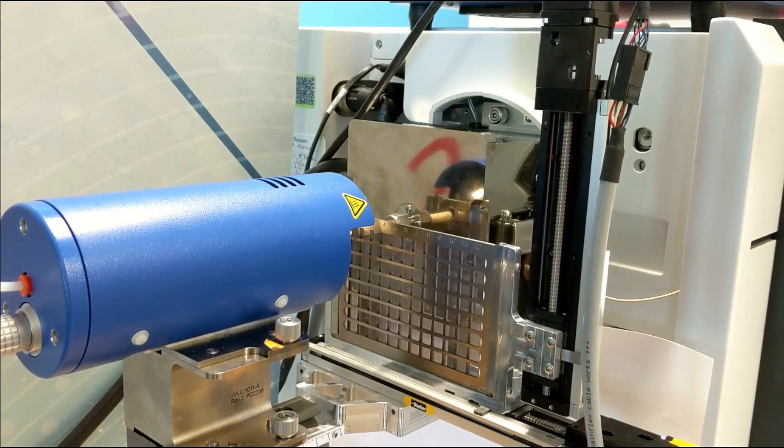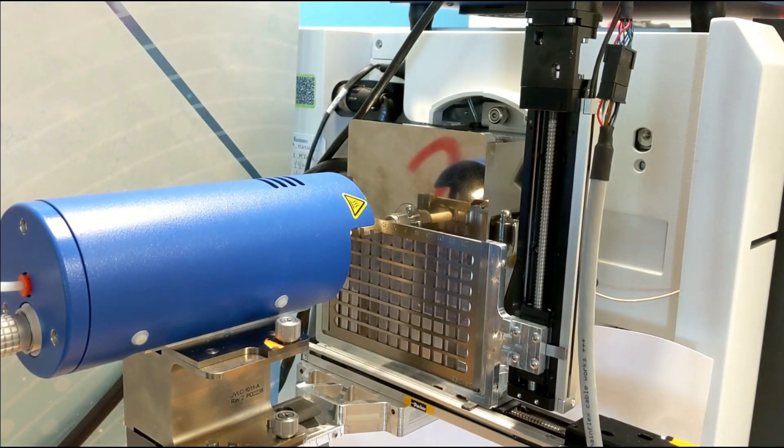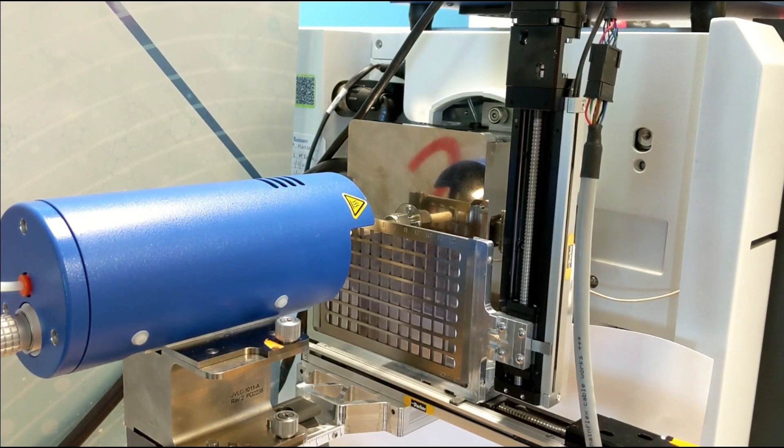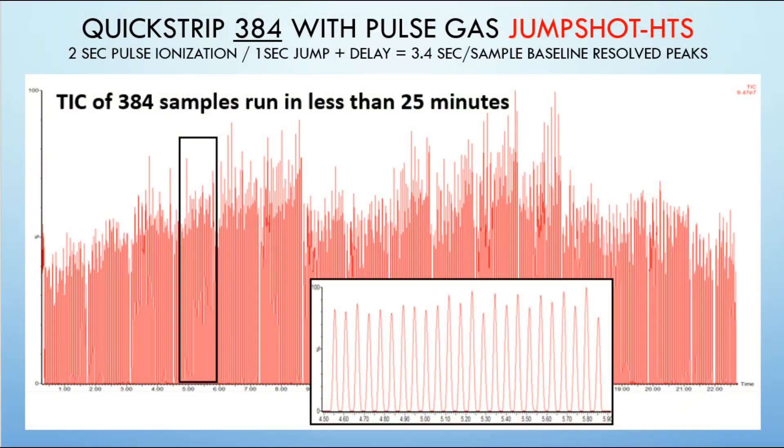This pulsing combined with our new linear rail automation hardware has increased our analysis speed, as it permits analysis of 96 samples in just 6 minutes, or as shown here, 384 samples in 22 minutes.